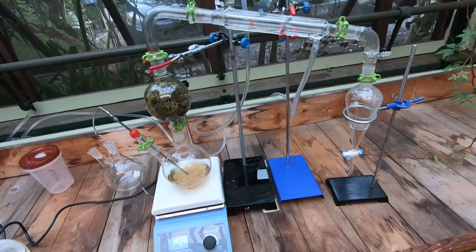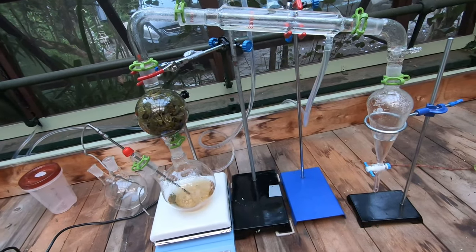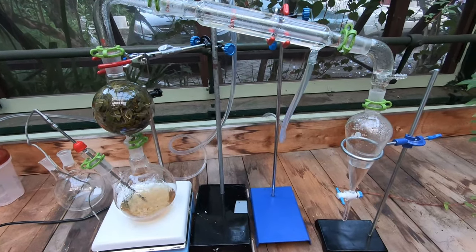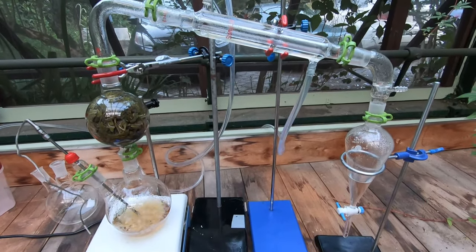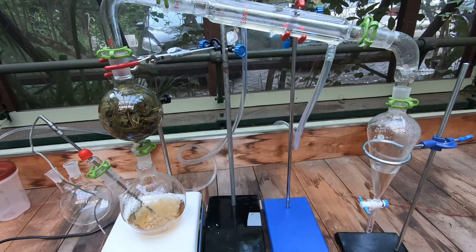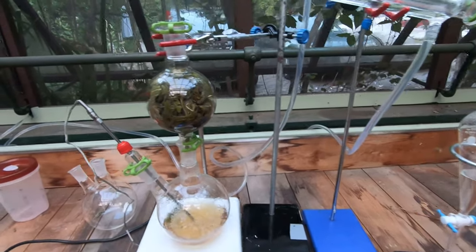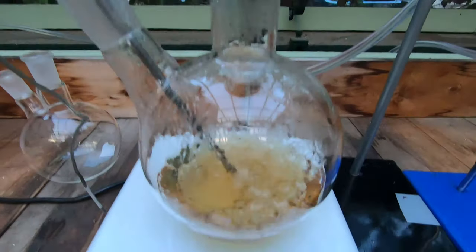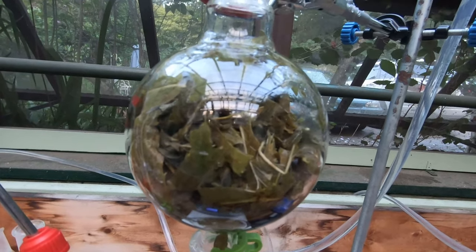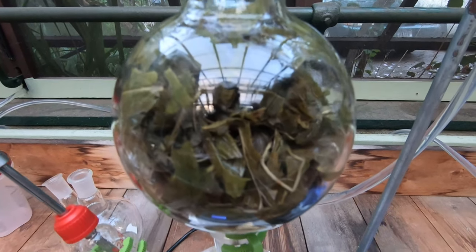I'm trying again. The first time I did it, I ended up getting a whole bunch of water-type stuff — sort of like a mint tea almost — but there was no obvious oil layer on top of it. So it makes me wonder where the hell all the mint oil went. I've seen other people do this before with a very similar setup and they seem to have had an oil layer develop pretty quickly. This time I have a lot more mint in the biomass flask — I chopped up a whole bunch of it to get as much surface area in contact with the vapor as possible.